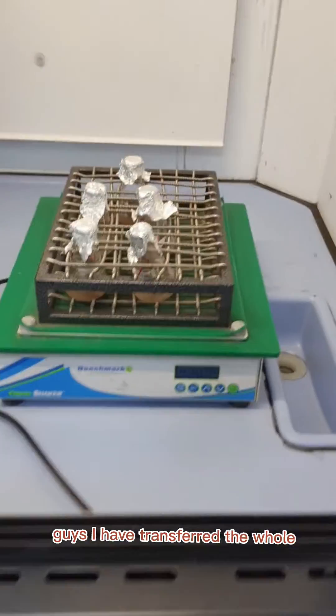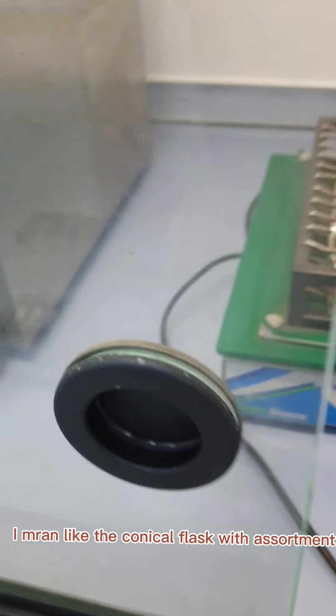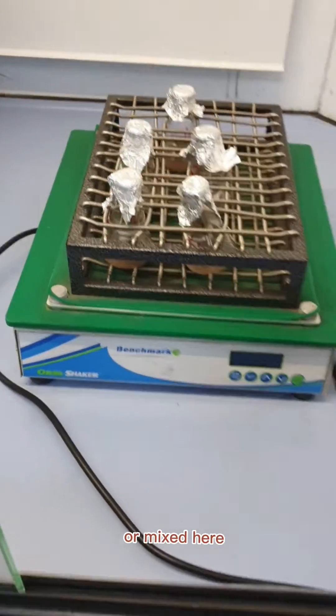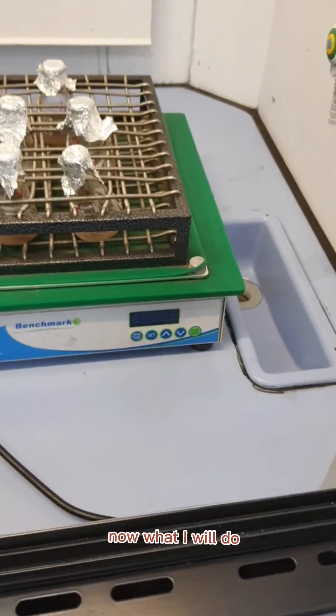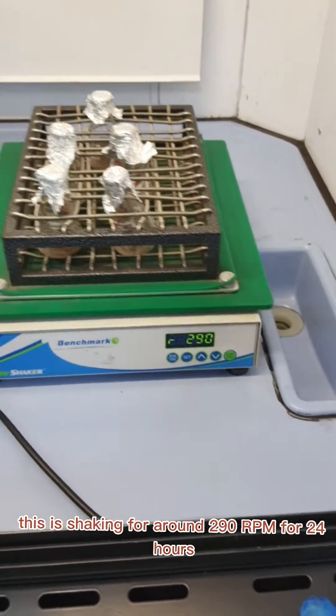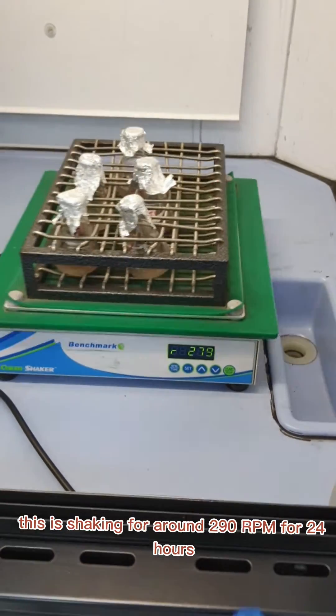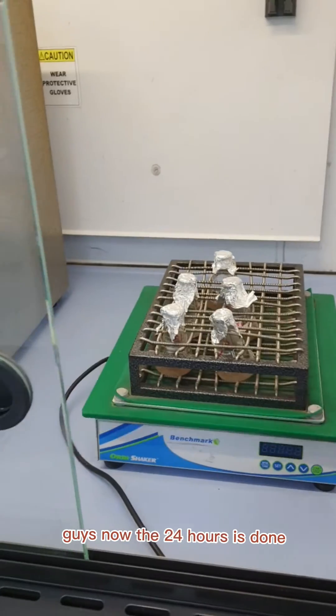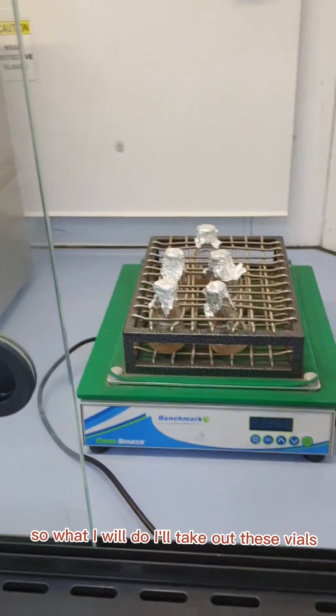I have transferred all the conical flasks with adsorbent mixed here. Now what I will do is start to shake. You can see here this is shaking at around 290 rpm for 24 hours.